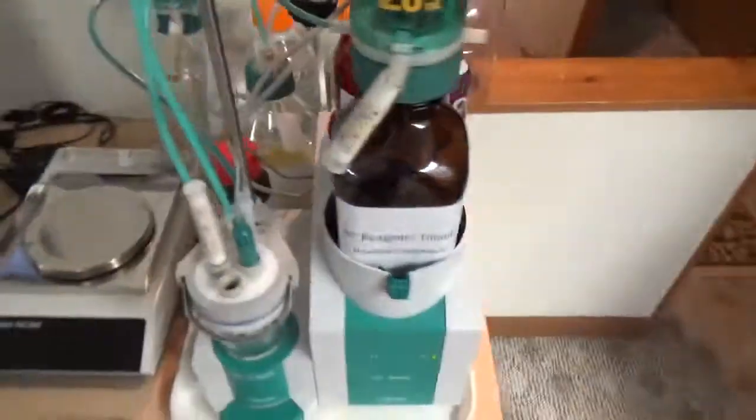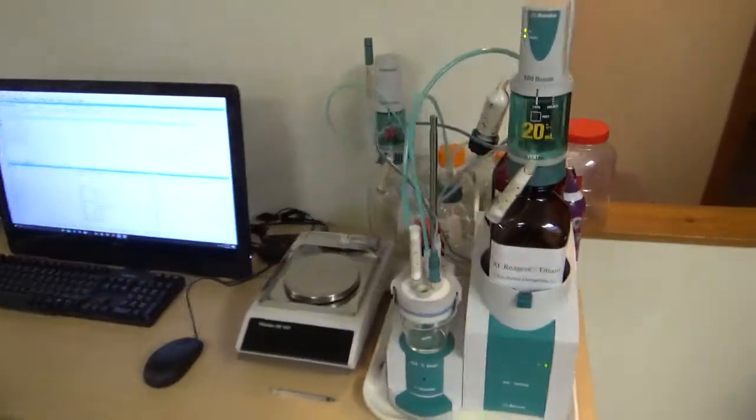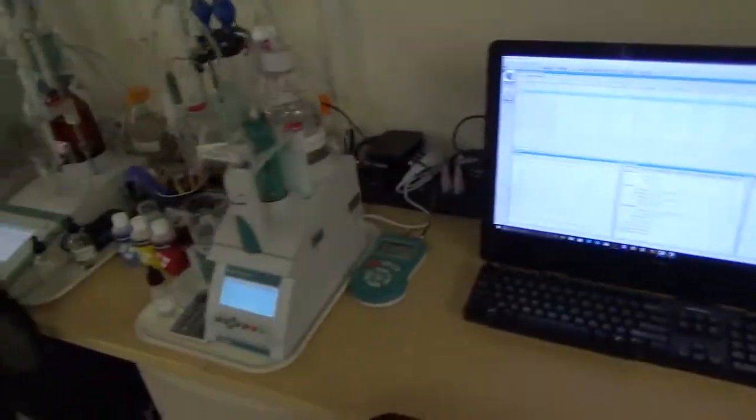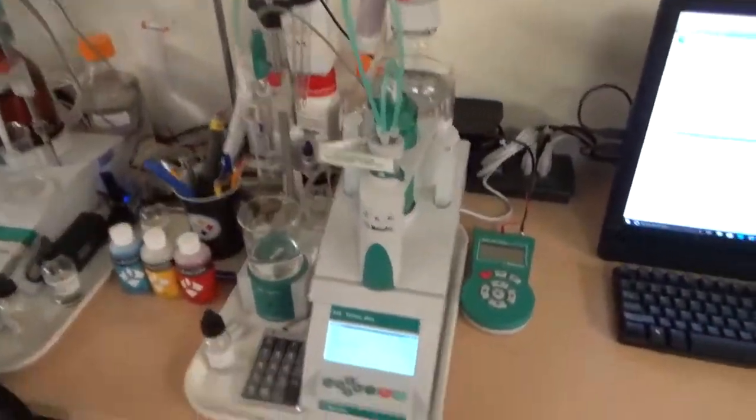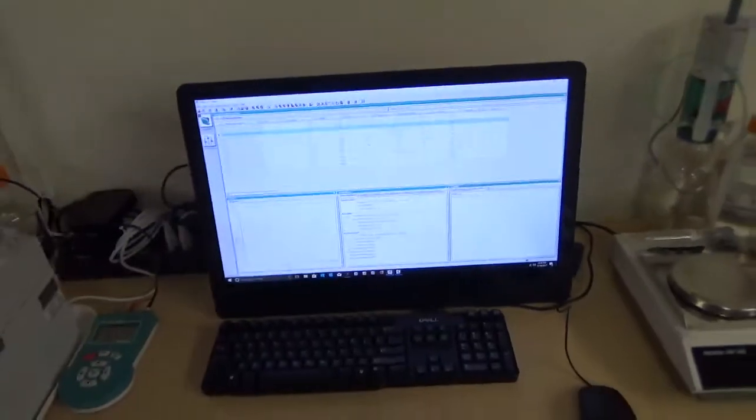For Karl Fischer titration, we also need a balance to determine the sample weight before and after adding the sample to the titrator. The titration is controlled by Tiamo software, which has a method set up to run Karl Fischer titration. We collect the data in Tiamo. For potentiometric titration for chloride or acid-base, we use T-Base software where data is collected and the titration curve and results are displayed.